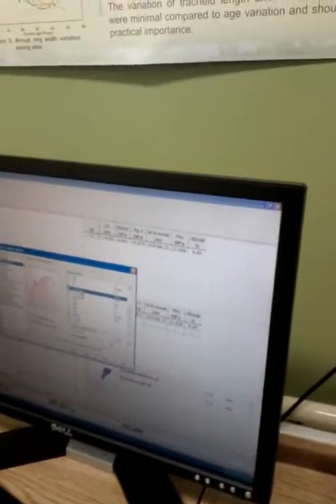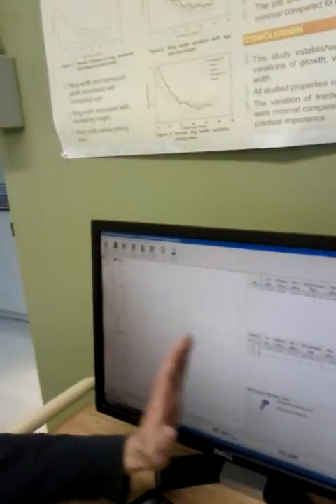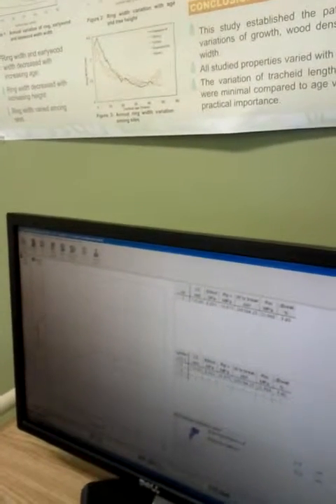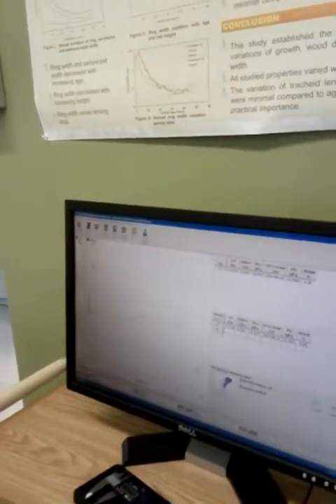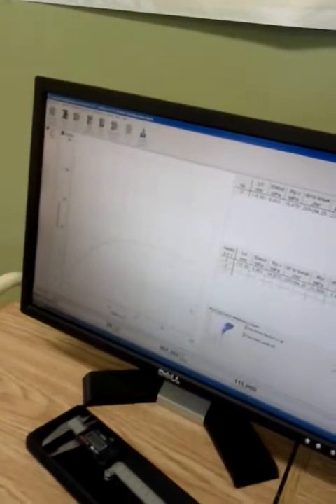Let me see. Work to break. Okay. This is the area under the curve. This is the energy up to break. This is the maximum resistance, about 24 here, as you can see, and the strain at break is about here, 9 and something. I always check if the numbers make sense, because sometimes they can be an error.